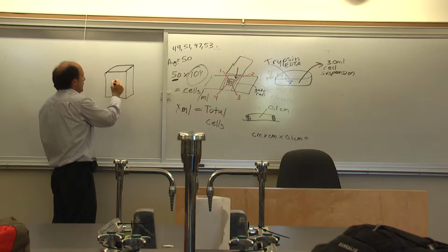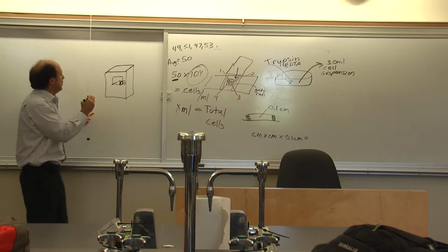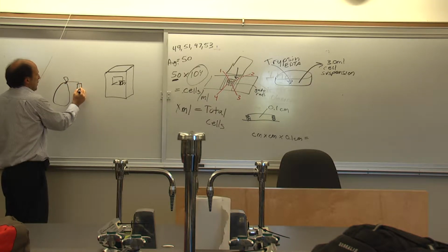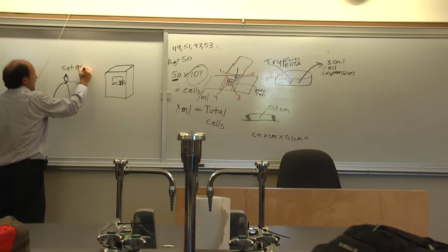So what does it have in there? It has a door on the side here, and you put your sample in a plastic cuvette. So it's a little plastic vial, and you squirt some fluid into your plastic vial. We have a pump delivery system, a big container over here. So you're going to squirt some of this fluid in here. This measuring thing here is already set to 9.8 mils.